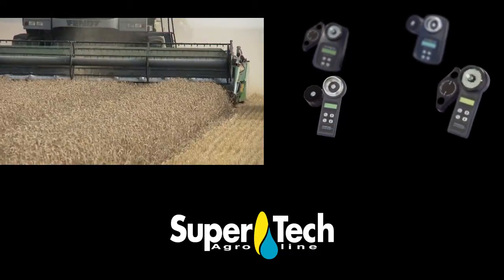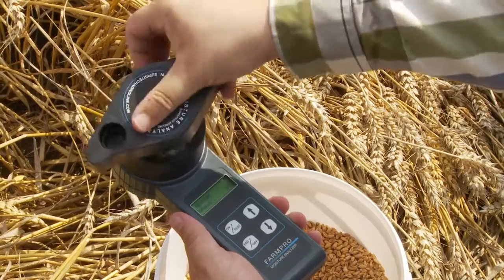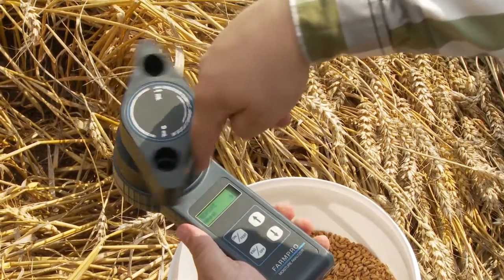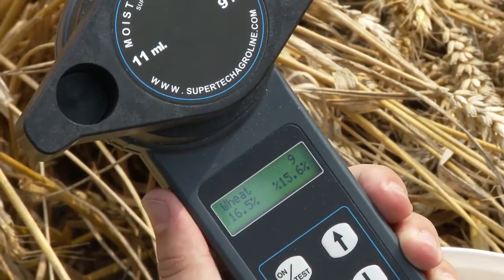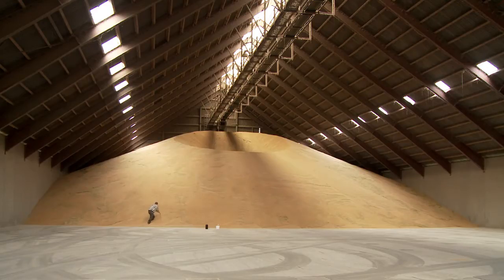FarmPro Moisture Analyzer is an easy way to determine the moisture content in crops, whether it is in the field before or during harvest, during the drying process, or afterwards in the storage.